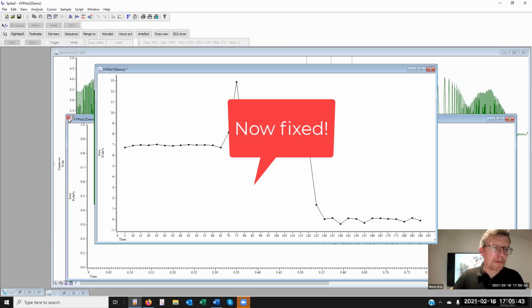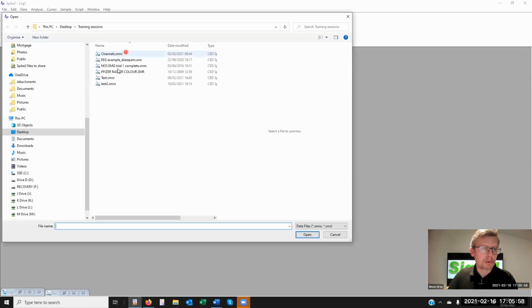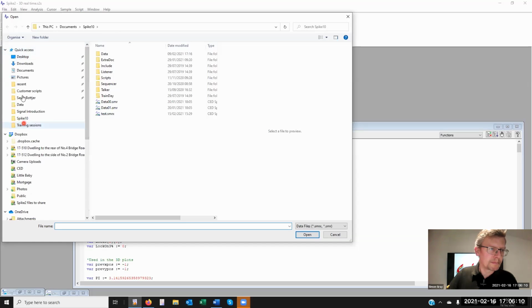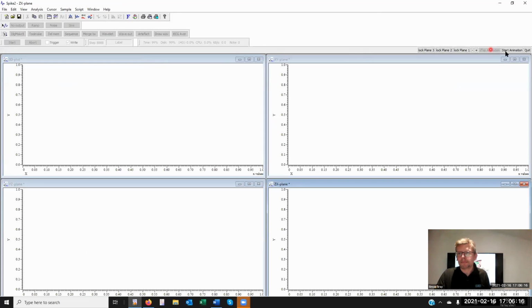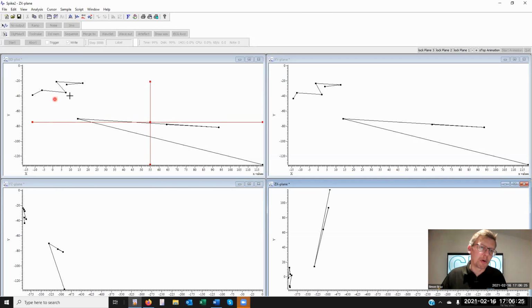My aim was to go through the XY plots and show you a few more measurement functions, but ultimately to get to here, where if I call this up a script, okay, run this and ask for a data file. Right, so I have a data file with movement data. That is points measured on this animal's body here.